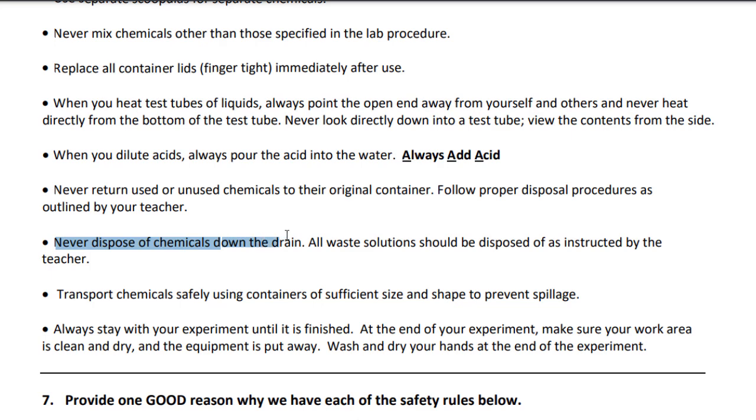This says never dispose of chemicals down the drain. That's not 100% true. Some of our stuff can go down the drain, but check with your teacher and make sure. Some of the stuff has to go into special containers to be thrown out in a special way. It's hazardous materials. And other things, it's pretty safe. I mean, if we're dealing with sugar, it's pretty safe to put that down the drain. So it just depends which chemicals we're messing with, and I'll let you know how you're going to clean up for every lab, okay?